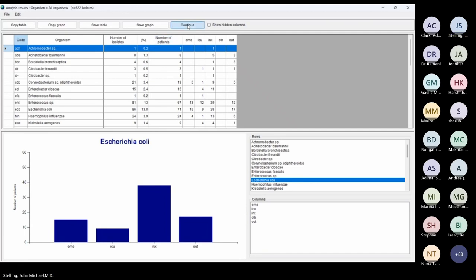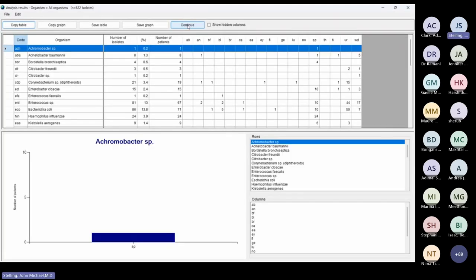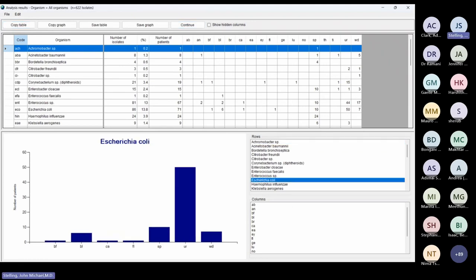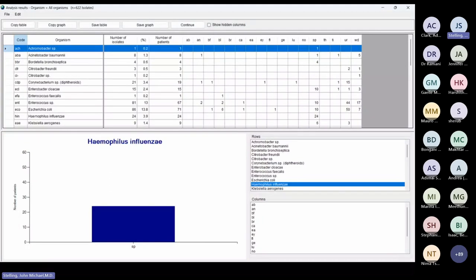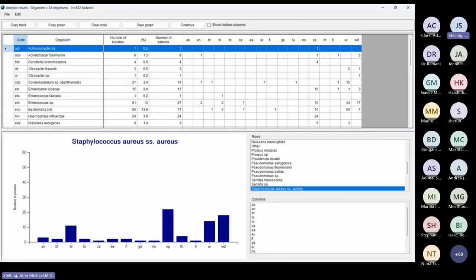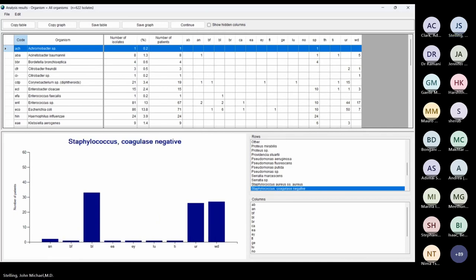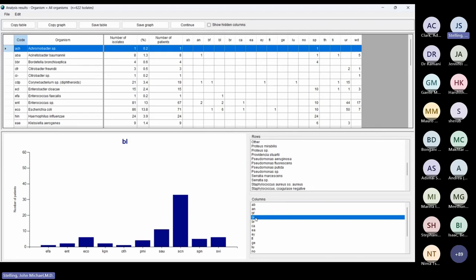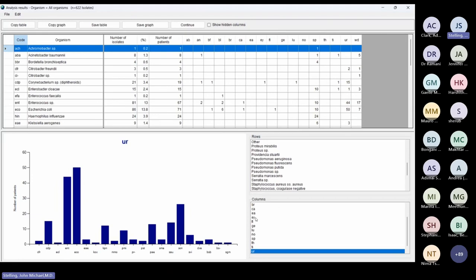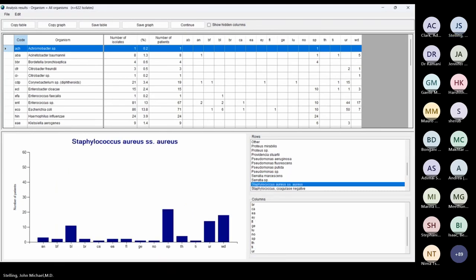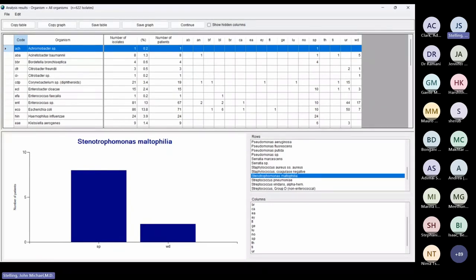Clicking Continue again shows the different specimen types. E. coli is by far most common in urine — not a surprise. Haemophilus is mostly sputum. Staphylococcus coagulase negative is often a contaminant, especially common in blood. If I choose specifically blood, it's mostly coagulase negative staph. Urine is mostly E. coli and enterococcus. Stenotrophomonas maltophilia is mostly sputum and wound.